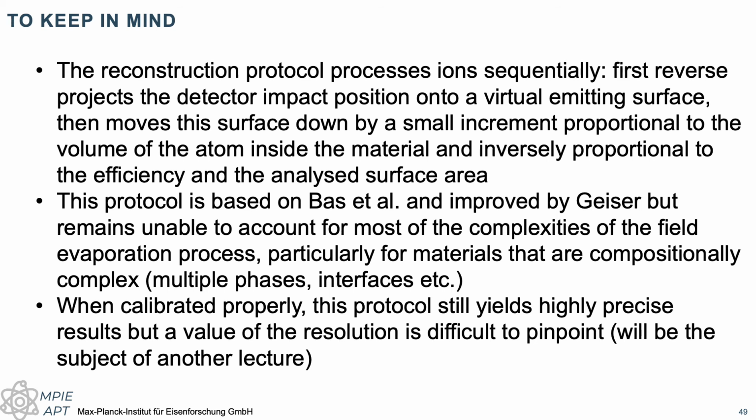Typically, when calibrated properly, this protocol still yields highly precise reconstructions and results that are the best we can do for now. But often I get asked, what is the resolution? And it's really difficult to pinpoint this, and I'll prepare a separate lecture on these aspects. So don't fall into the trap of saying that atom probe has atomic resolution. It's really not very true. And we need to always be a bit wary of the fact that there are trajectory aberrations taking place no matter what. So there's always a bit of error that we need to take into account in the discussion of the results.